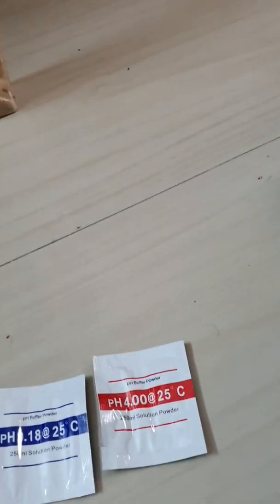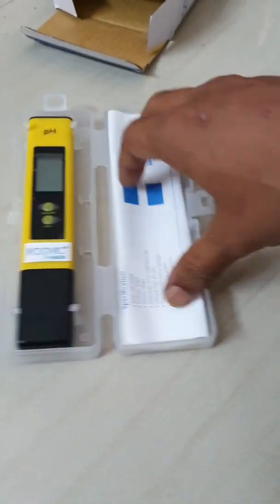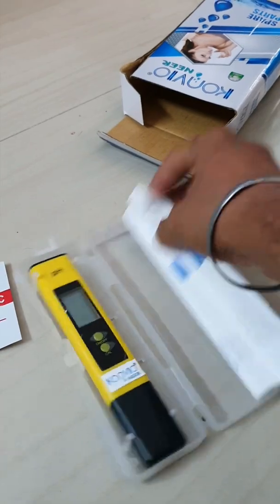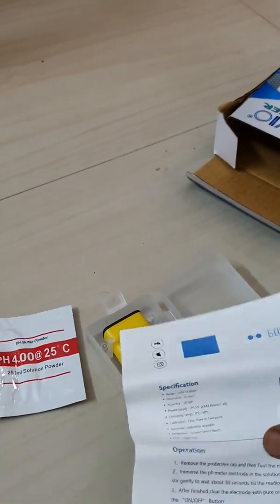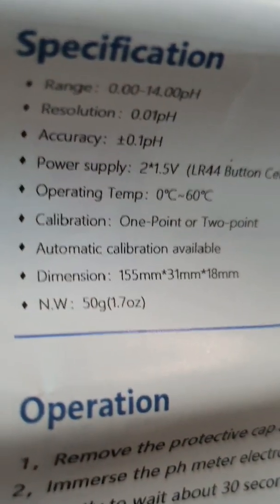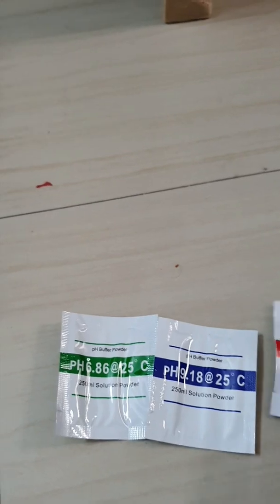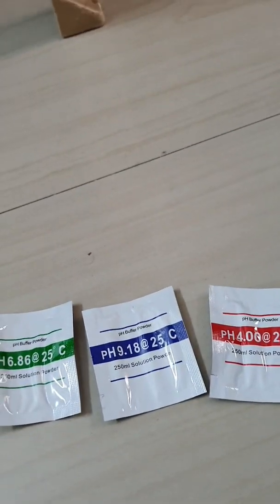These are used for calibrating the device. Before the device, let's see what else we have. There is some paper here showing the range, accuracy, power supply, and calibration details. These pouches are used for calibrating the device and need to be mixed with distilled water.